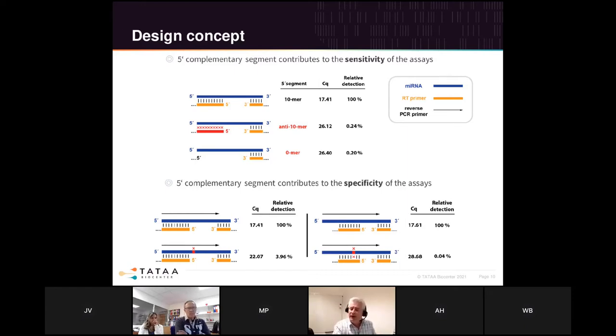First of all, the impact of that mutation is much greater in the hemiprobe, because the hemiprobe is about, whatever, in this case, 8 bases. And that means that the base variant disrupts 1 out of 8 contacts, while in the PCR case, it disrupts 1 out of 20. So the impact is much greater. And then furthermore, you sense it in the downstream PCR, depending on what happens in the first round.